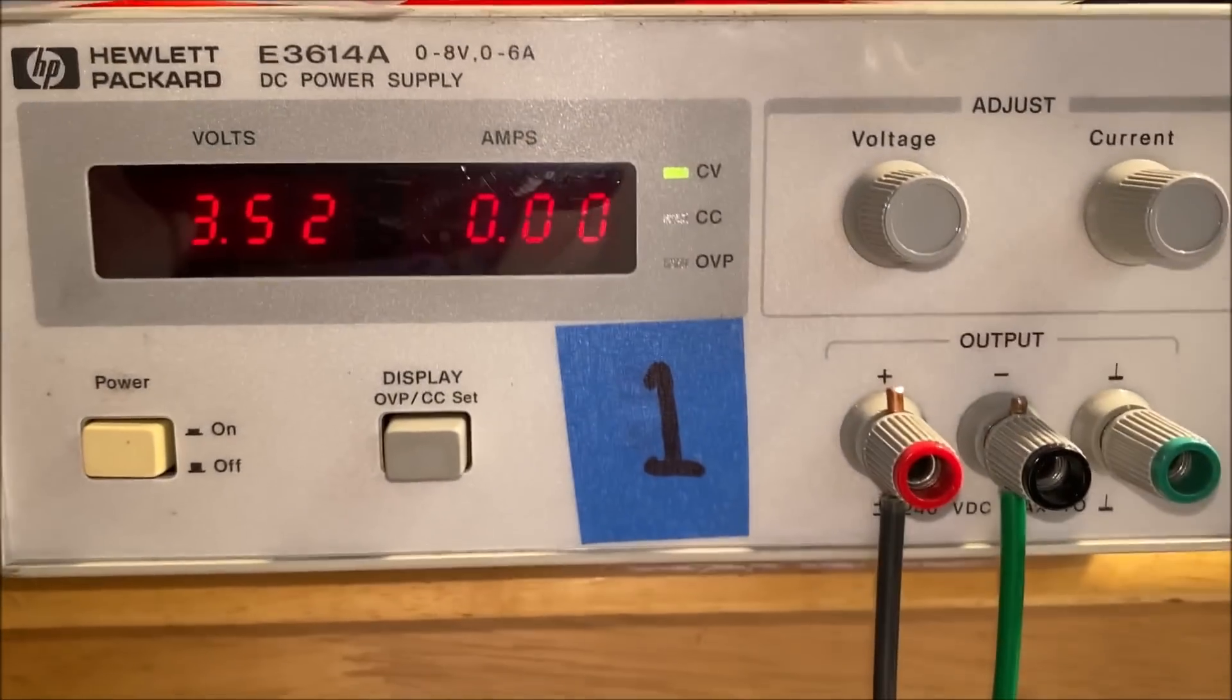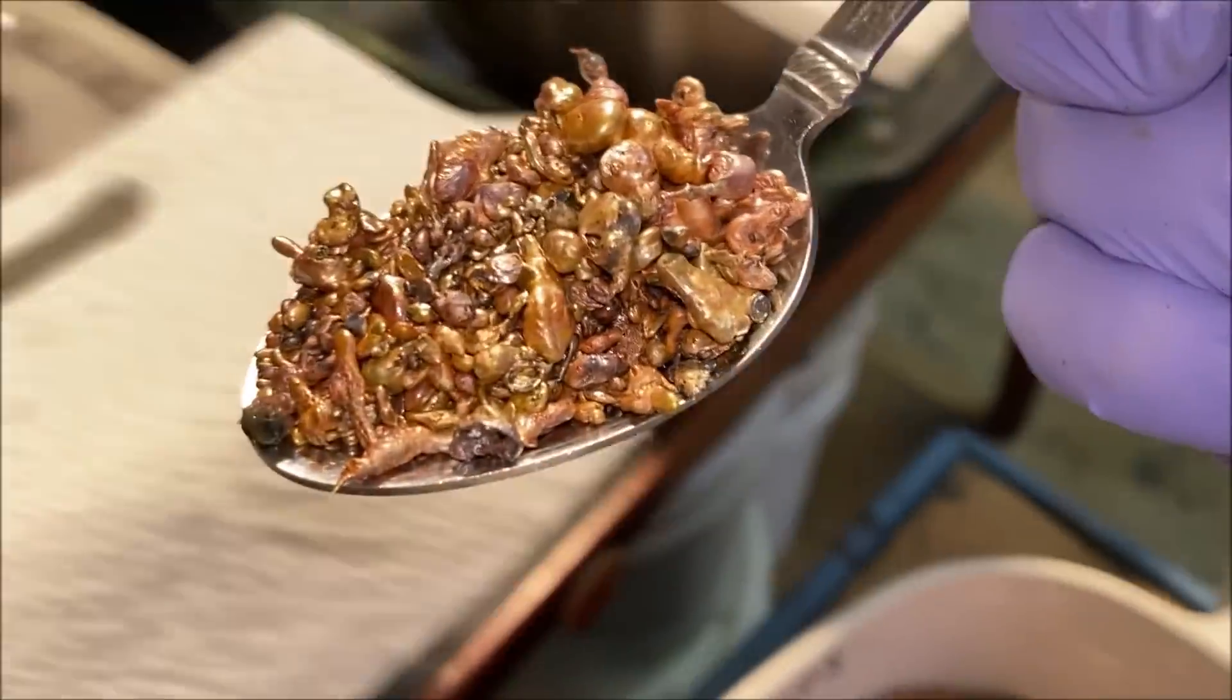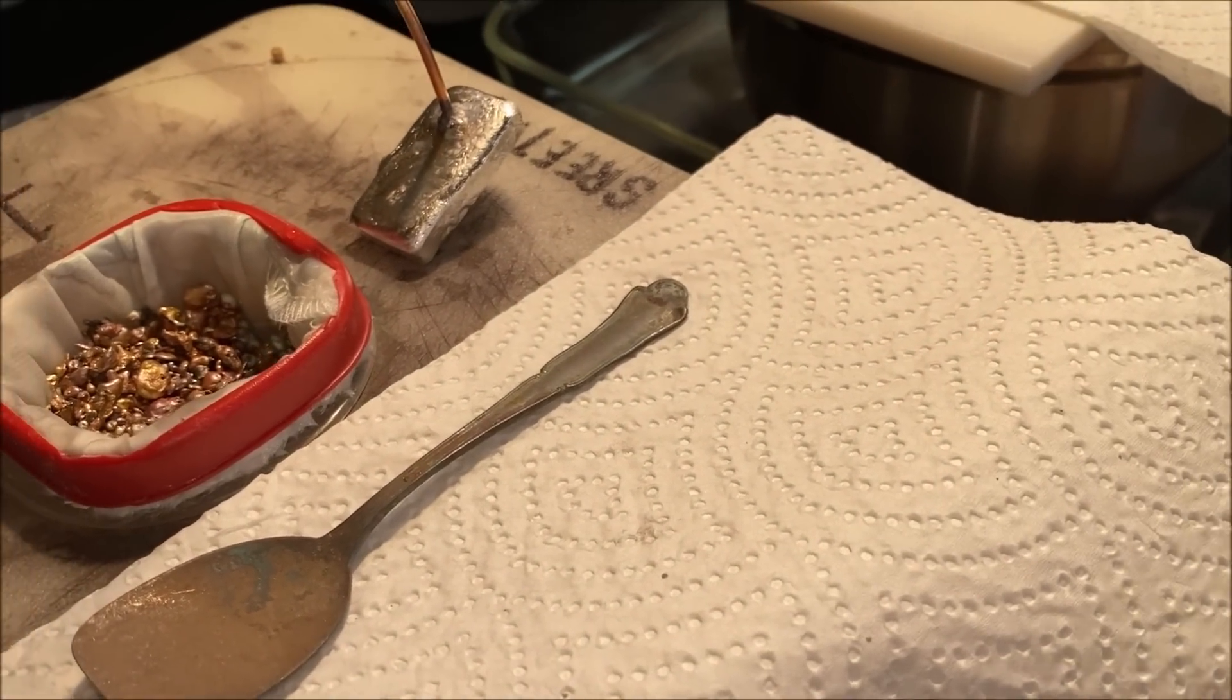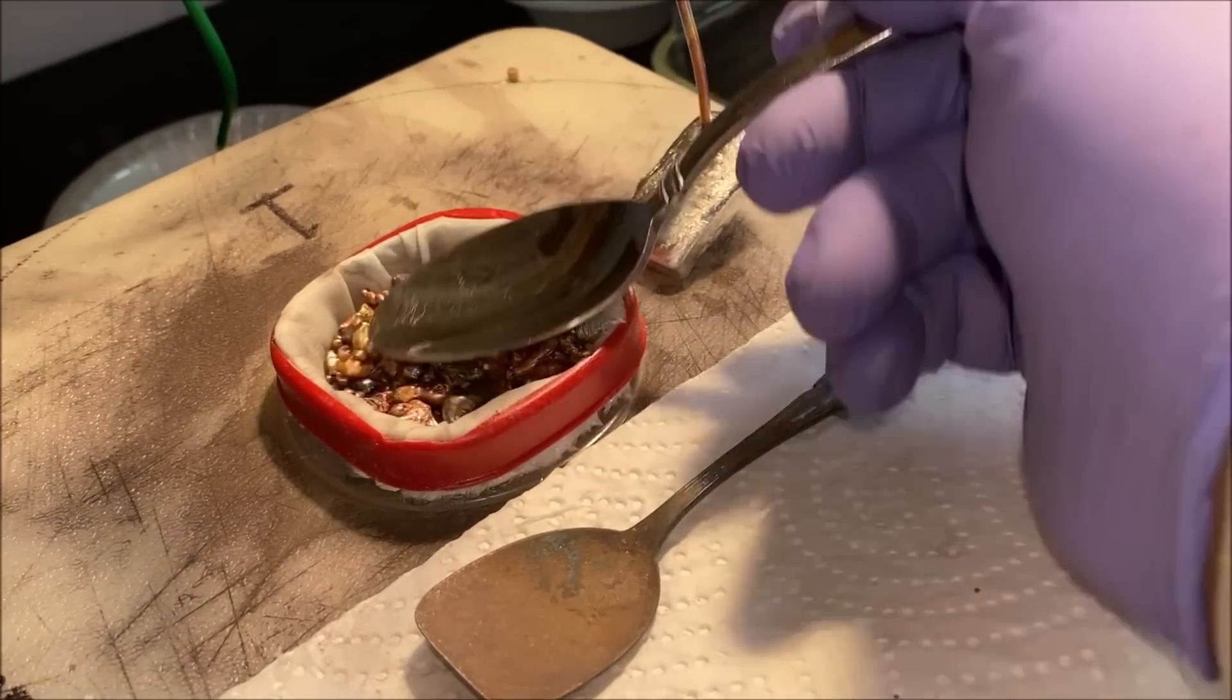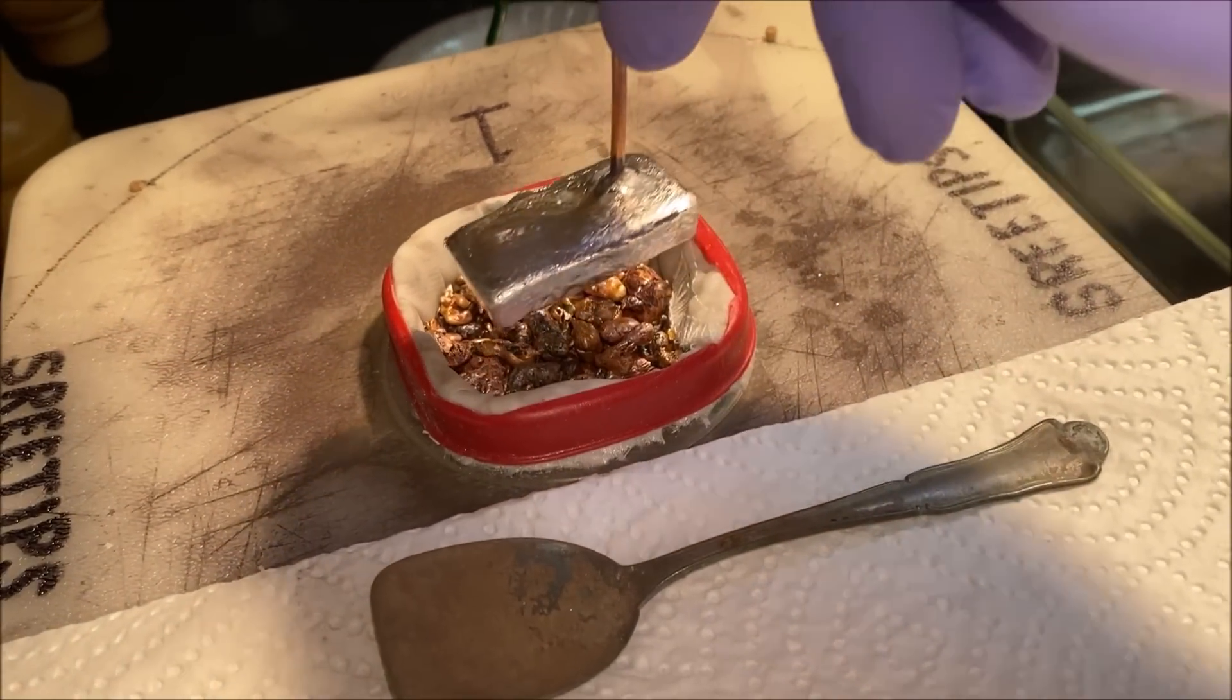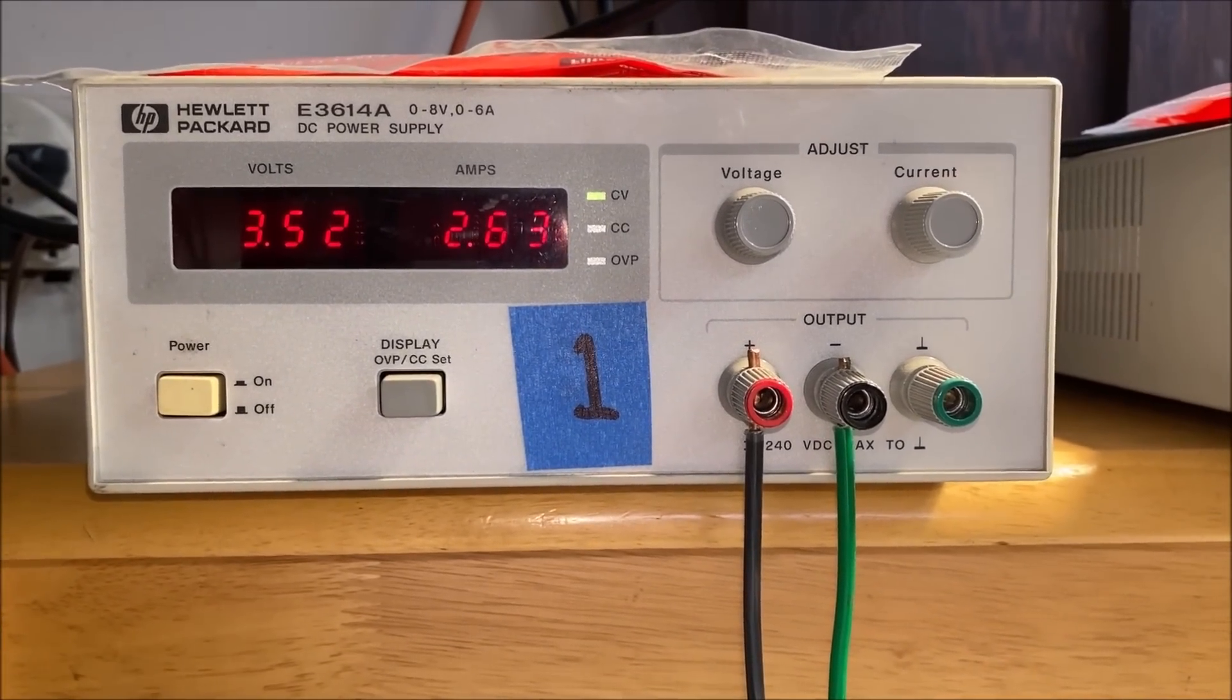I'm going to go ahead and pull this out. Of course the current flow goes to zero when I do that. Now we're going to add some additional silver in here. It took two big spoons to fill that thing back up. I'll put this back on the silver and now you can see the current flow is up to 2.6 amps.